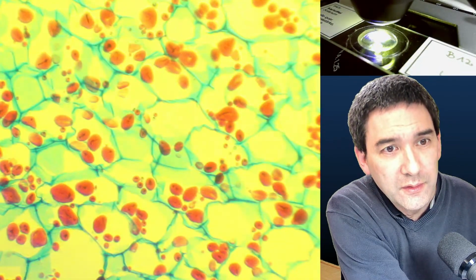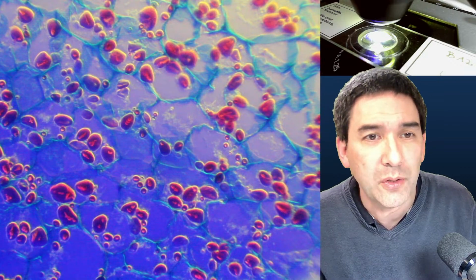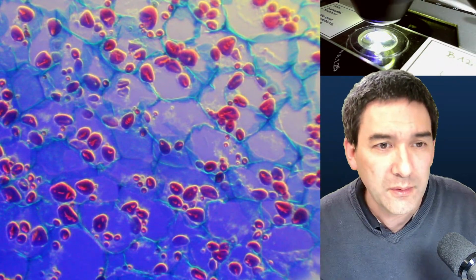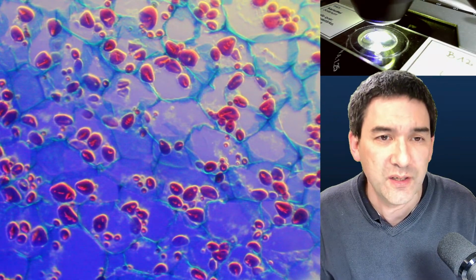This is the one with the squares, but this is the yellow-blue one. I think this looks again quite pretty because the starch grains have a bright halo around them. Right, so it actually does increase the contrast.